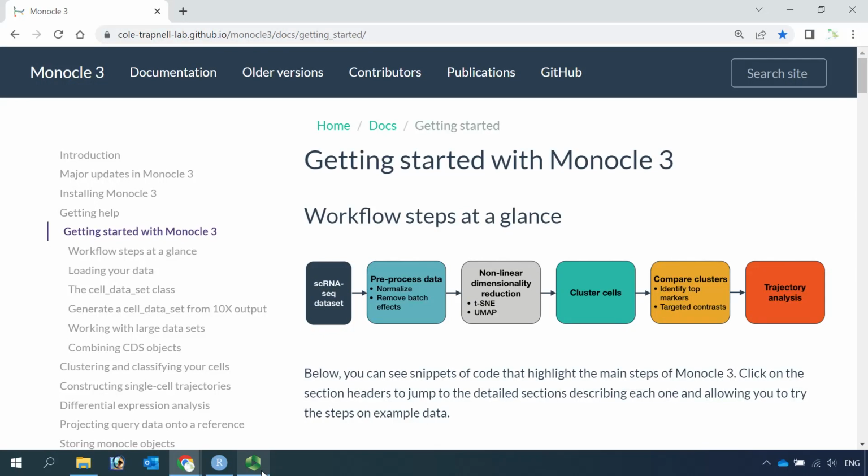Hello, welcome back to my video tutorial for single-cell RNA and ATAC data analysis. From today, I'm going to make videos to show you how to use Monocle3 and perform single-cell trajectory analysis.